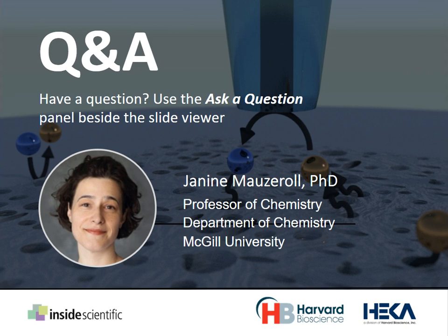Excellent. Next question here. Nagash has said, hello, Professor Mauzeroll. That was a very interesting talk. I'm new to the field and would like to know if SECM can be used or has some potential for wet etching nanofabrication in situ using scanning imaging techniques. Do you or your colleagues or collaborators have any similar experience in this field? Thank you very much. Well, thank you for attending and thank you for asking a question.